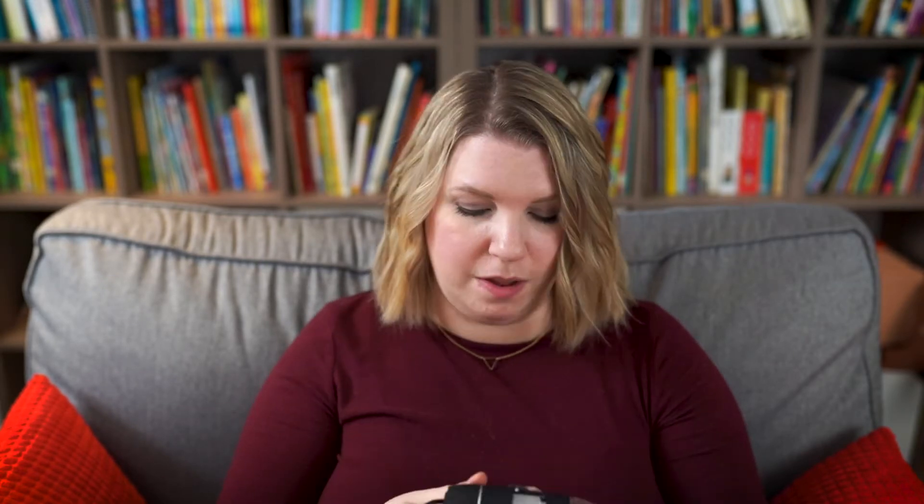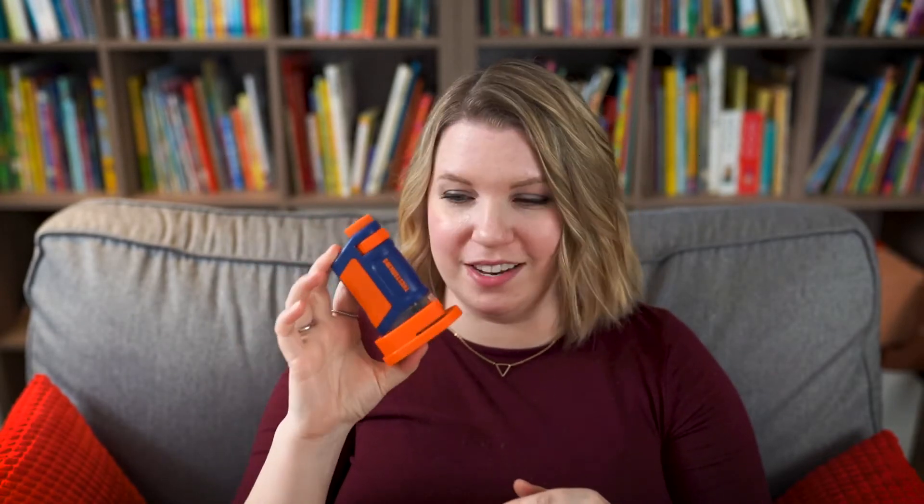As much as we do love it and use it all the time — especially for really, really tiny things — it is not necessarily the most kid friendly microscope. So when STEM Kids asked us if we wanted to be gifted a microscope, we definitely jumped on it. I want to show you the portable microscope from STEM Kids.